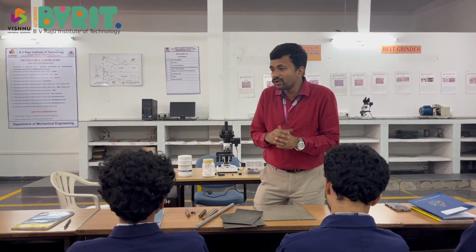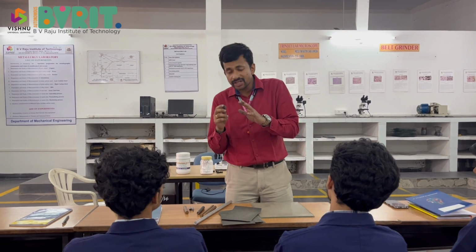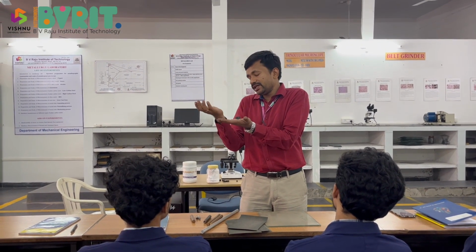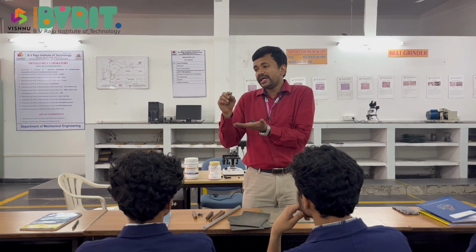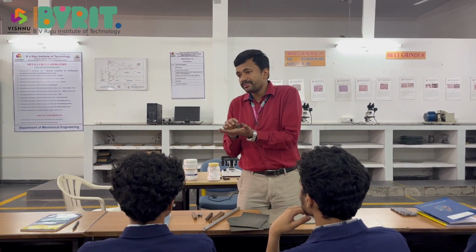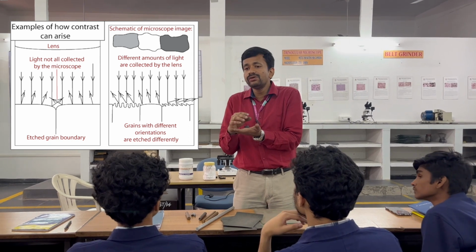So we take this specimen after the mirror finish and place it in a plate containing this etchant for the suggested time to react. It will be very fast, hardly 10 seconds.